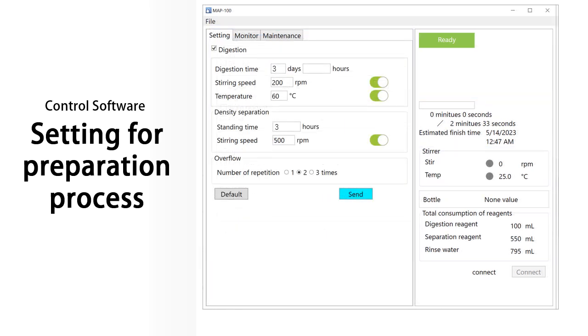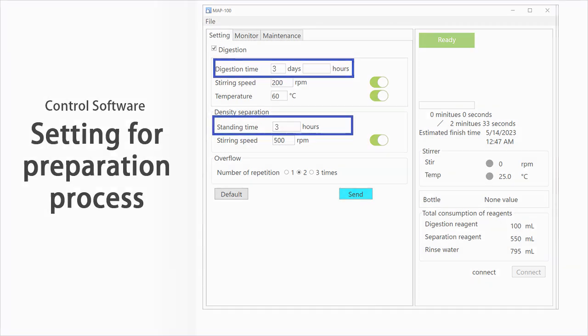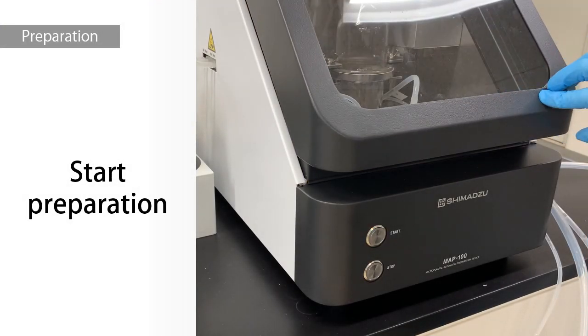This time, we conducted digestion for 3 days and gravity separation for 3 hours based on the guidelines of the Ministry of the Environment. Now close the lid and press the start button to begin the preparation.